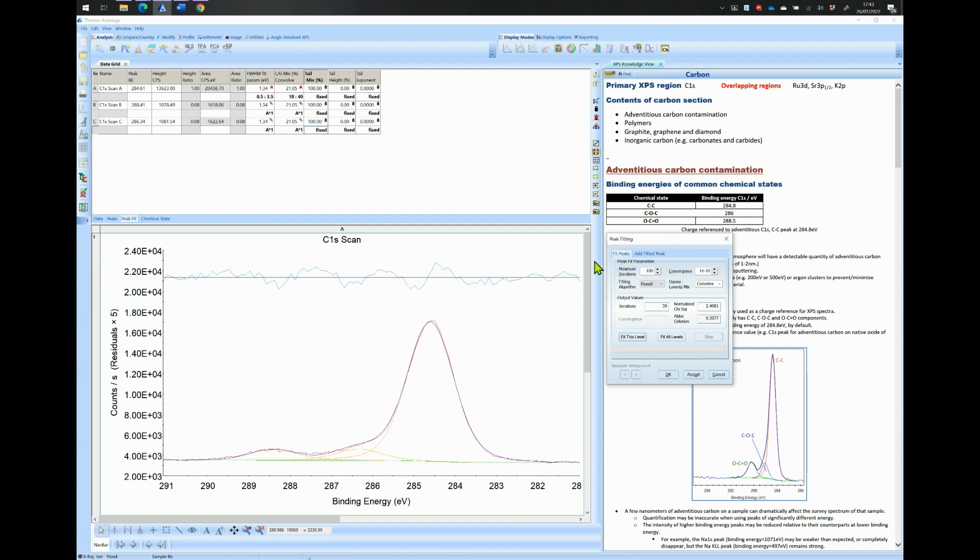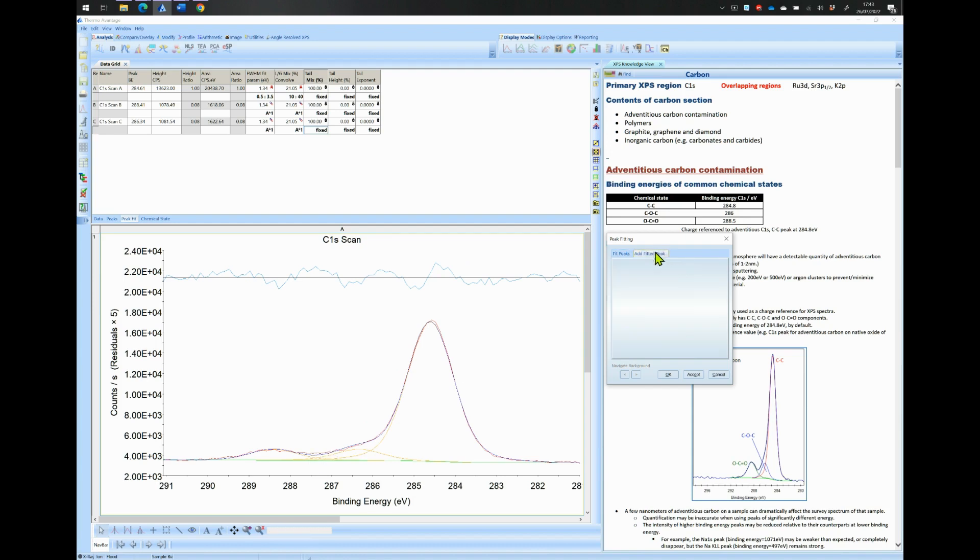If this is not the case or if it does not fit well, then this is an indication that there may be another peak. In this example, the C single bond O is not close to 286 eV and as you can see it does not fit very well around 287 eV. Let's add a fourth peak.